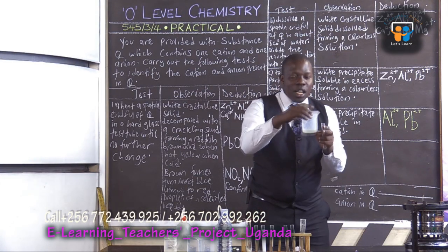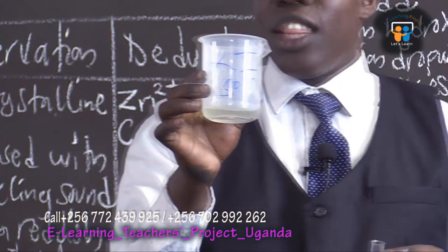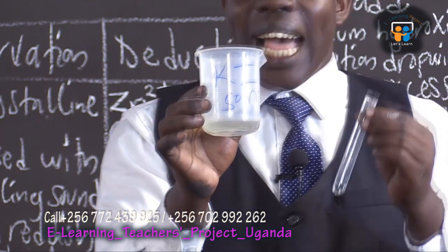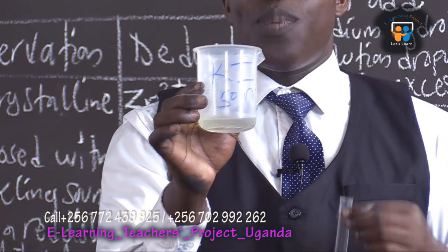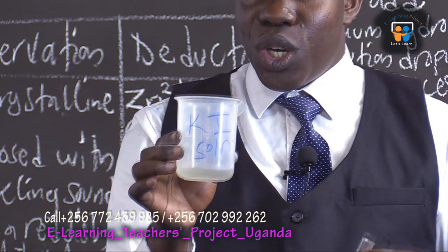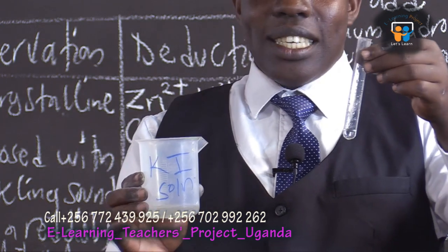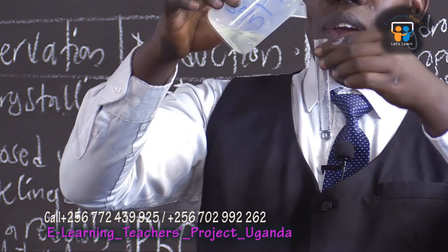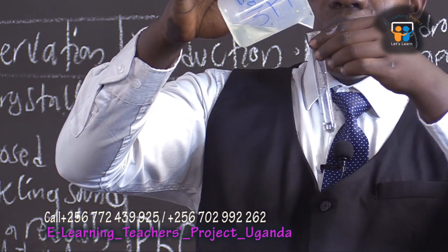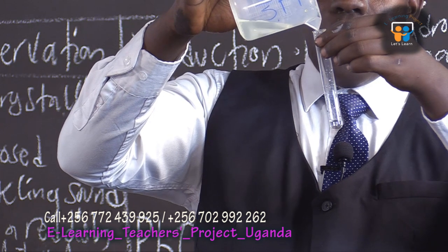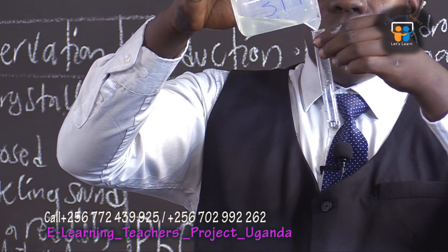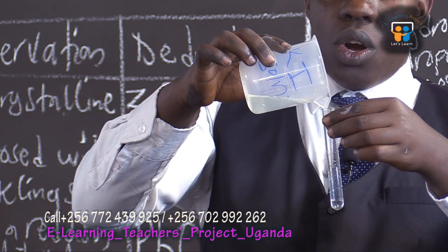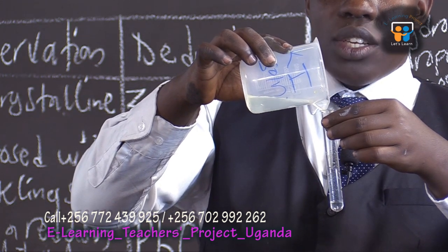This is potassium iodide solution, ladies and gentlemen. Those of you who are watching, you can see KI, standing for potassium iodide. Our solution is colorless. We are going to add potassium iodide and see what we shall observe. We are adding slowly by slowly.